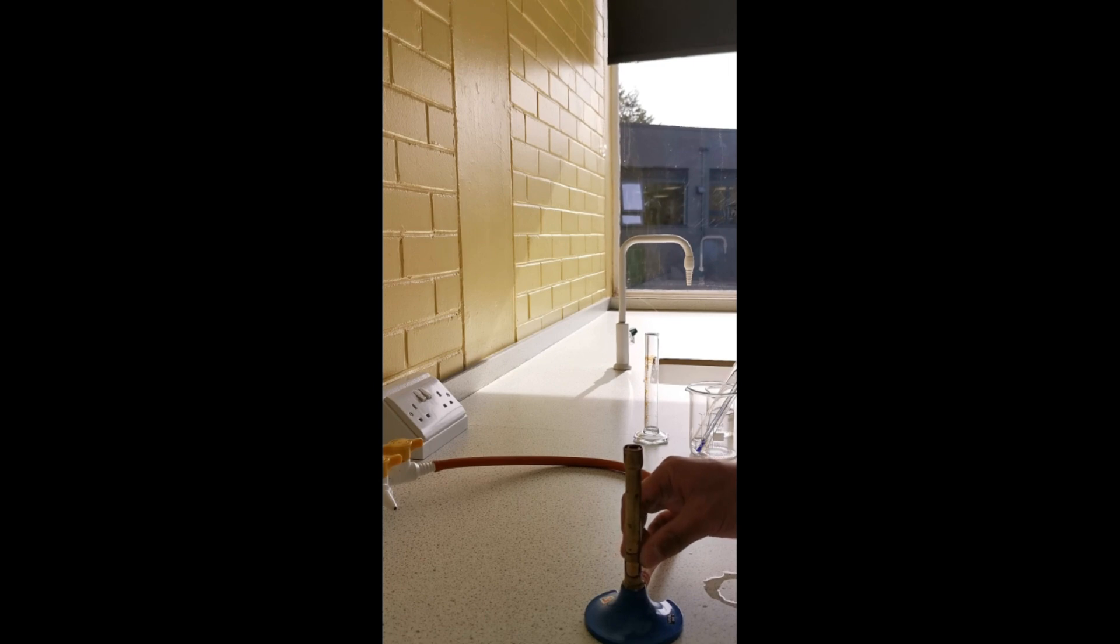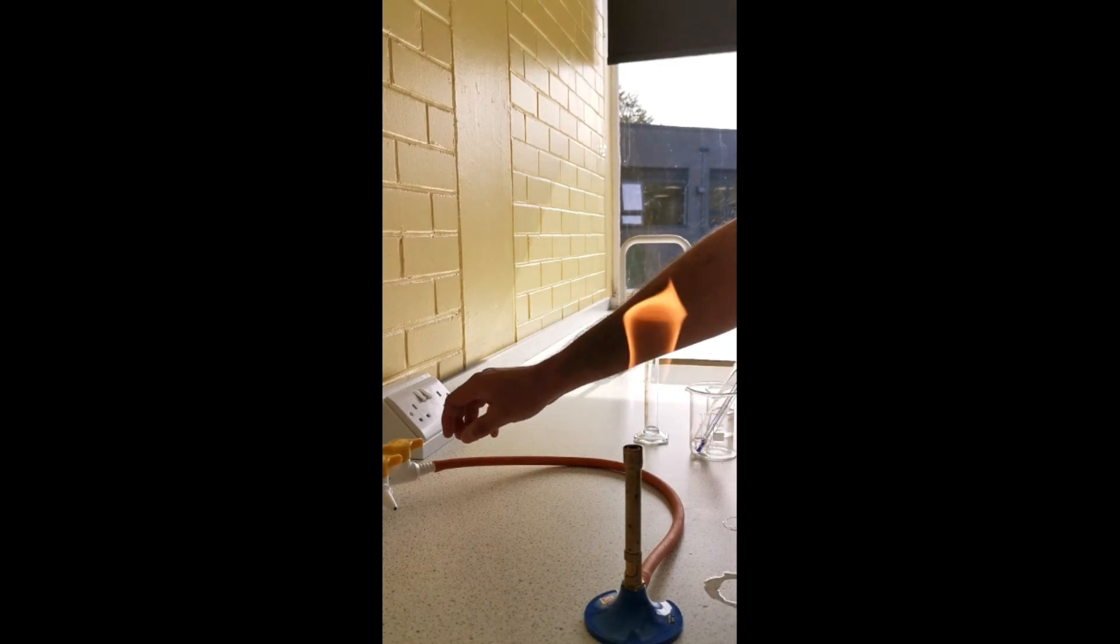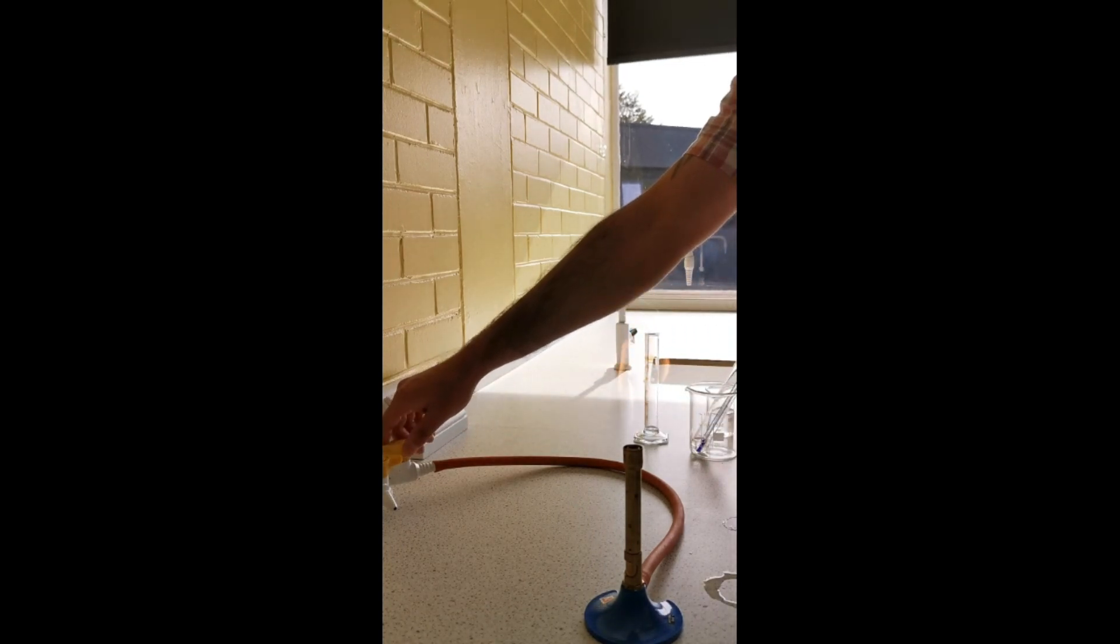When you're not using it, you want to turn it back on to the orange safety flame so everyone can see that and we know that this Bunsen burner is lit.